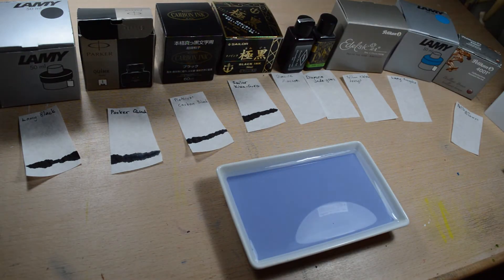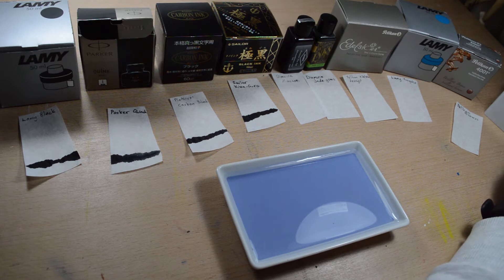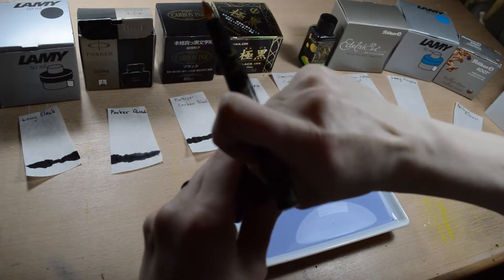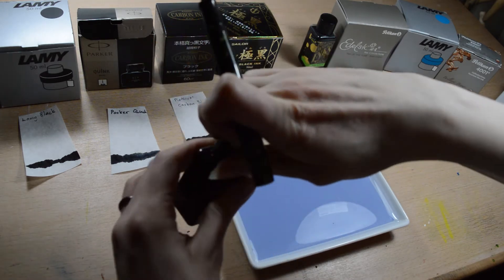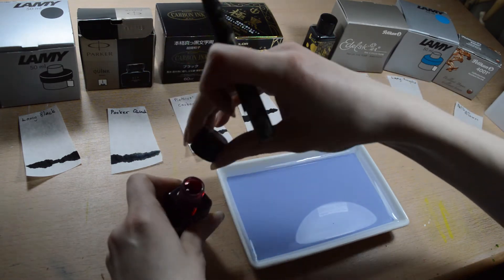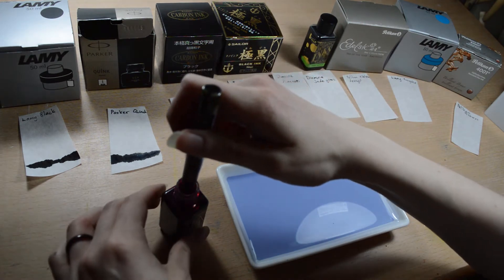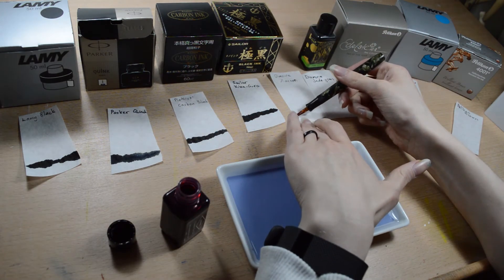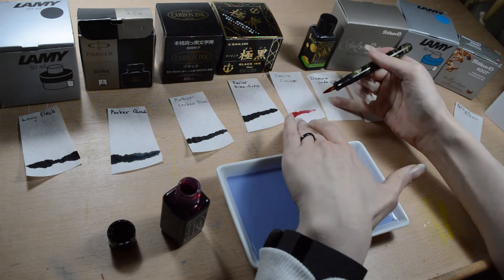And next we have some colored inks, because I decided that I want to do the chromatography for all of my inks, to know what these are made of. And this is Diamond Maroon, which is a nice deep red.